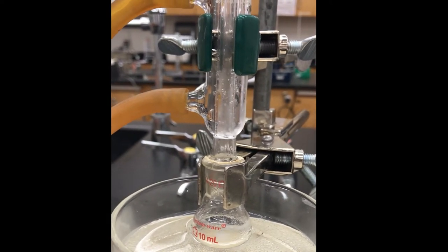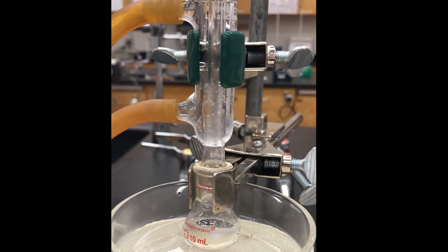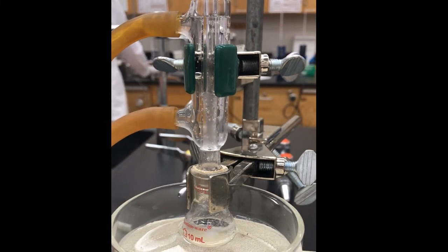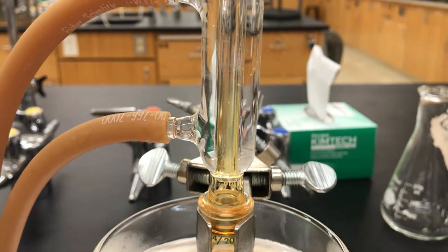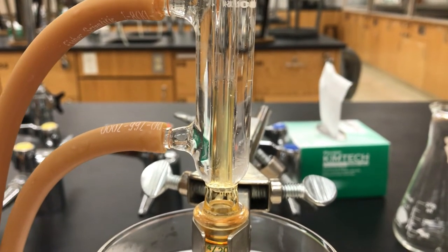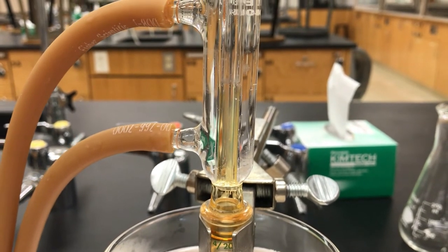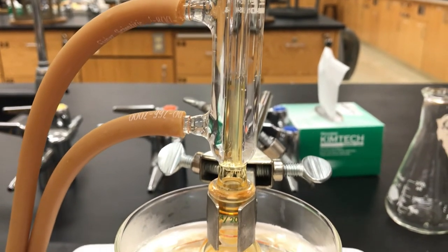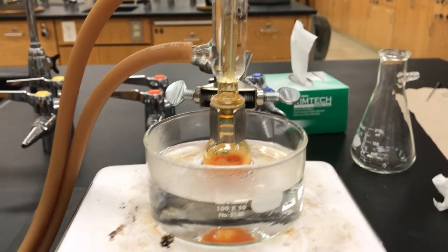We have dichloromethane that is refluxing, and you can see those obvious droplets that are happening in the condenser and falling back into the original flask. And here's another example of a bromine solution in dichloromethane that is refluxing. And this time the condensation in the condenser looks different, but you can see from the color that the reflux ring is about halfway up the condenser. You do want to watch that. If it gets higher than halfway, you would want to raise the flask out of the heat source and probably drop the heat as well.